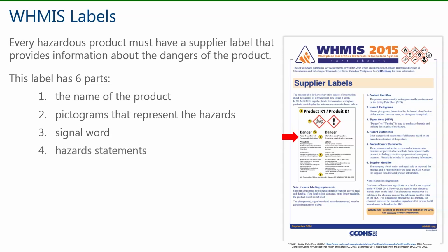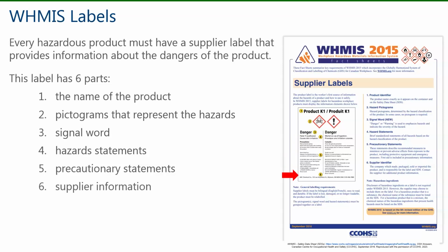There'll be hazard statements, precautionary statements, for example, telling you how to protect yourself from the product. For example, you may need to wear gloves. And there'll be supplier information. Who made the product? How do you contact the supplier?